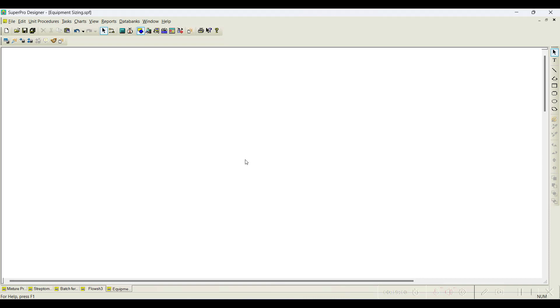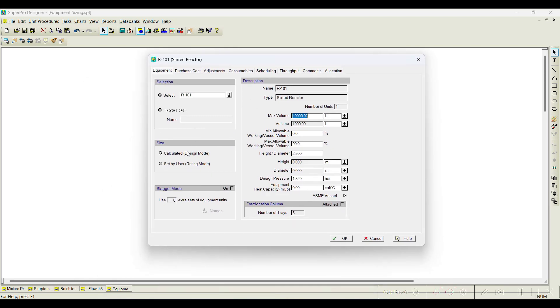Let us go to the SuperPro software and take an example of a reactor. I will place it here. If I right-click on the equipment data, you can notice that by default there is something called 'calculated size' — by default it will be in design mode. When in design mode, you can notice there is something called maximum volume, which is basically the maximum capacity of the reactor available in the market.